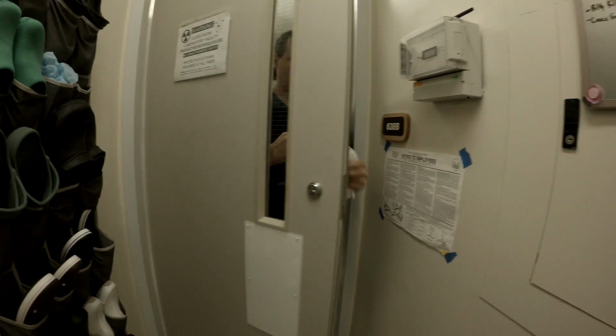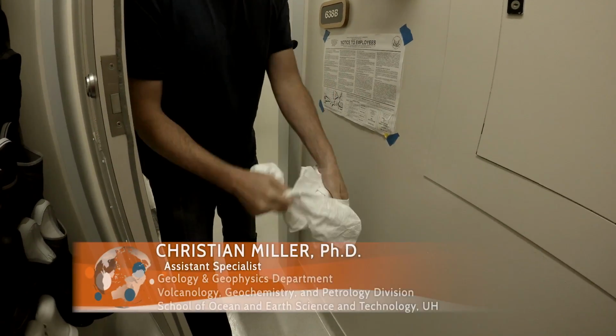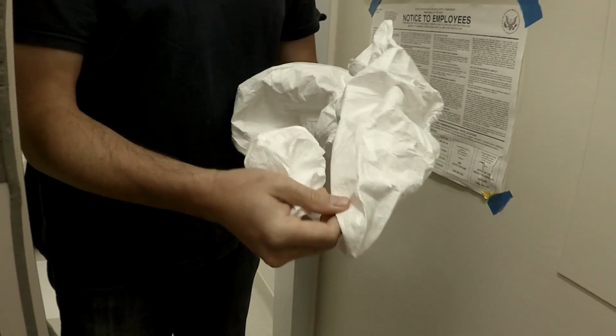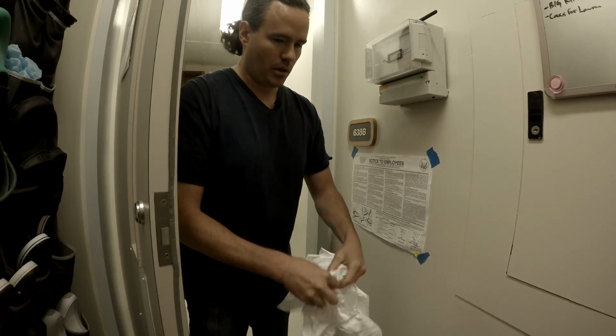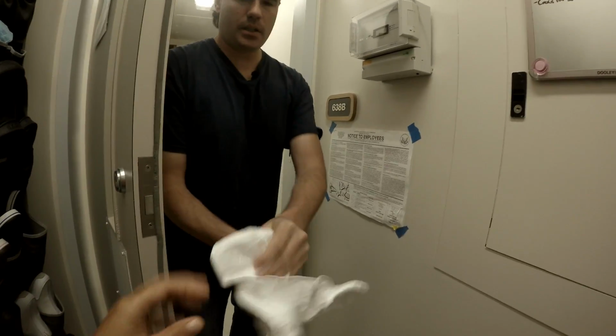When you guys are ready to step over onto here, you can put your feet inside some of these. One thing to be aware of is that the floor can be slippery when you're wearing them because there's very little grip. So there should be a pair for you and a pair for Kenisa. Thank you. And we just go through there. Usually just put these on over your head. Yeah.